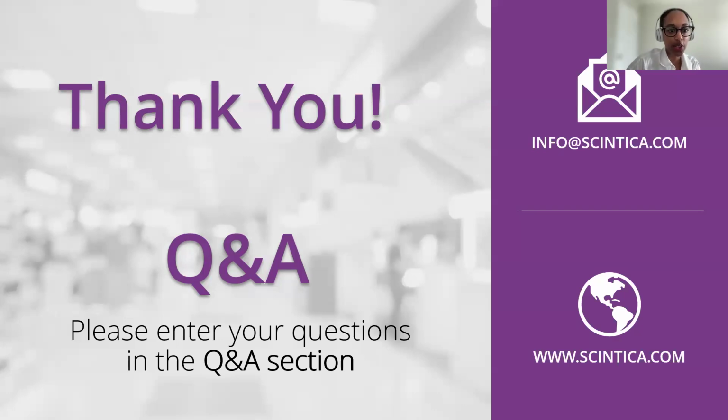And back to Steve. Is the UIC planning to offer a storage space, or is it up to the user to retain all the data? All the data that is generated by any of our instruments is the responsibility of the user. We do provide, as I mentioned, a method of transferring them from the instrument to a transfer server, and then each user can pull them off from there and put them in their own lab management and data management program. Very easy to do. Very easy.